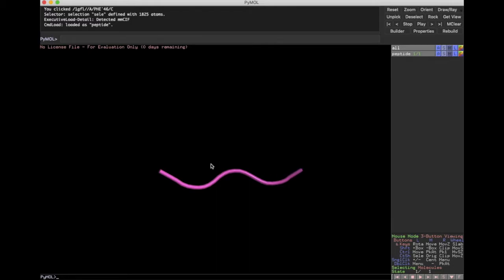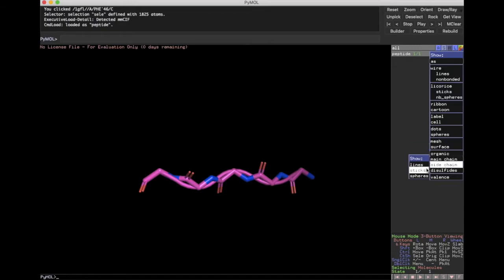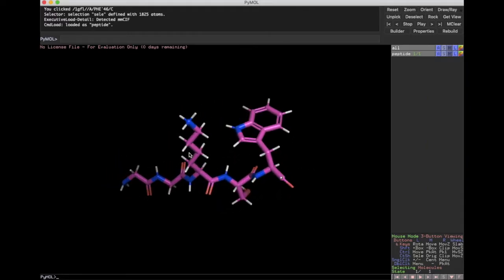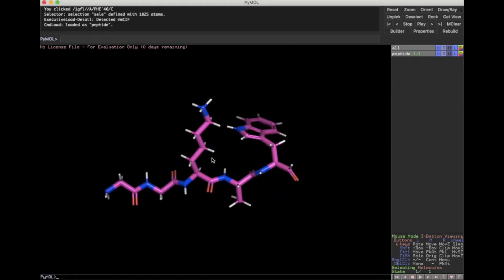Okay, so this is the peptide we created. It is the cartoon structure right now. So I'm just going to go ahead and show the main chain as sticks and the side chain as sticks. And I'm going to hide the cartoon. And we're sort of where we were before. Again, it's a bit of a different color because PyMOL seems to assign random coloring depending on when you're opening things. And so I want to draw your attention to the backbone here.